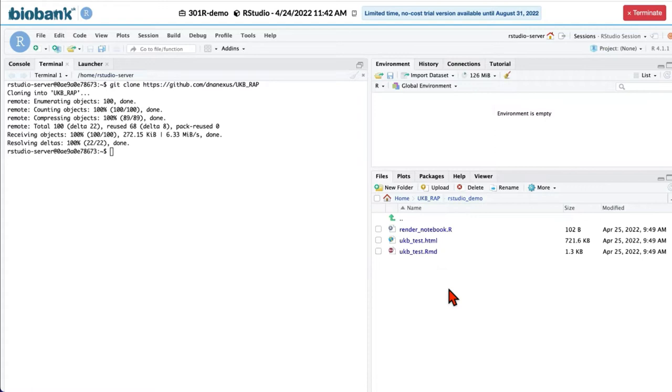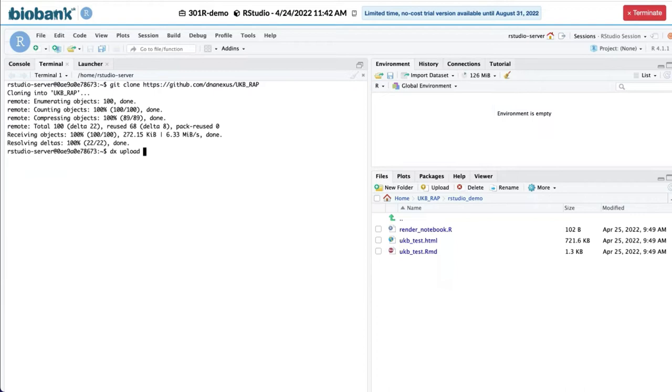If you want to upload the folder to the RAP project, you need to use command line utility from the DX toolkit, which is called DX upload. And we will be using parameter R as recursive because we will be uploading the whole folder.